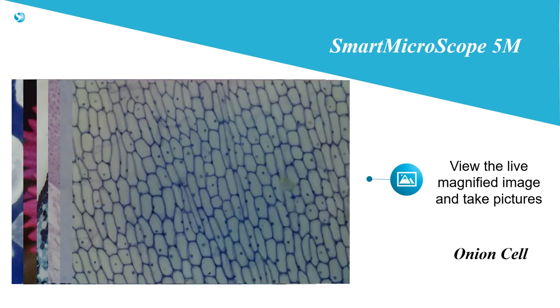They have the freedom to put it on anything — rocks, plants, clothing, hair, skin, soil, and yes, even microscope slides.